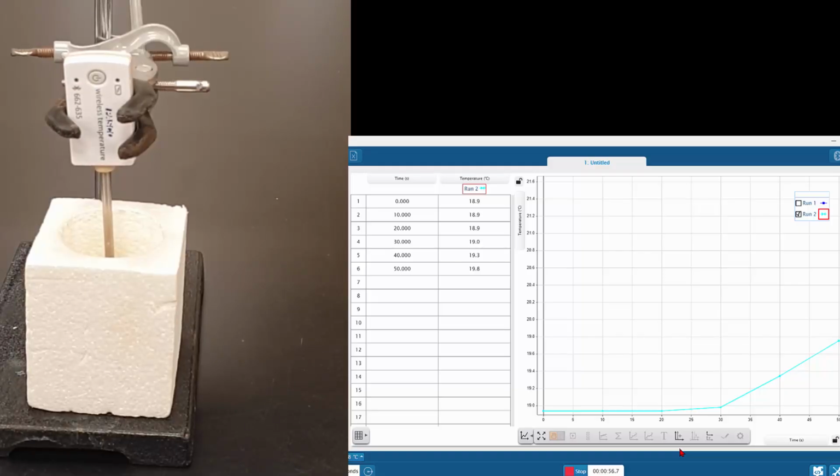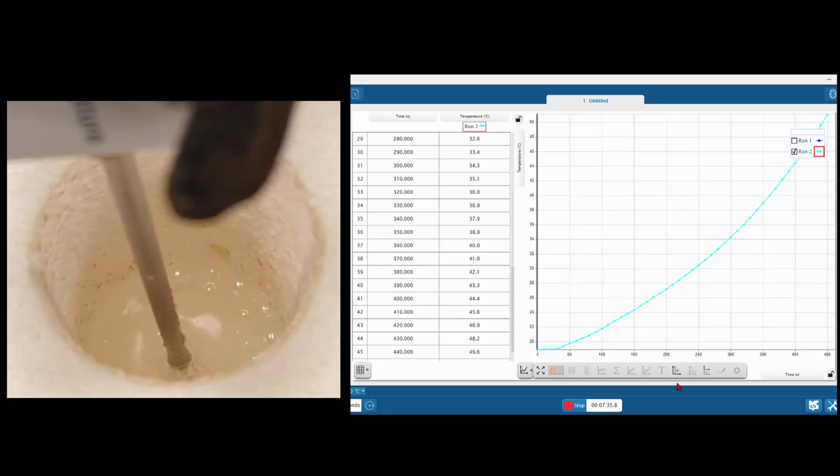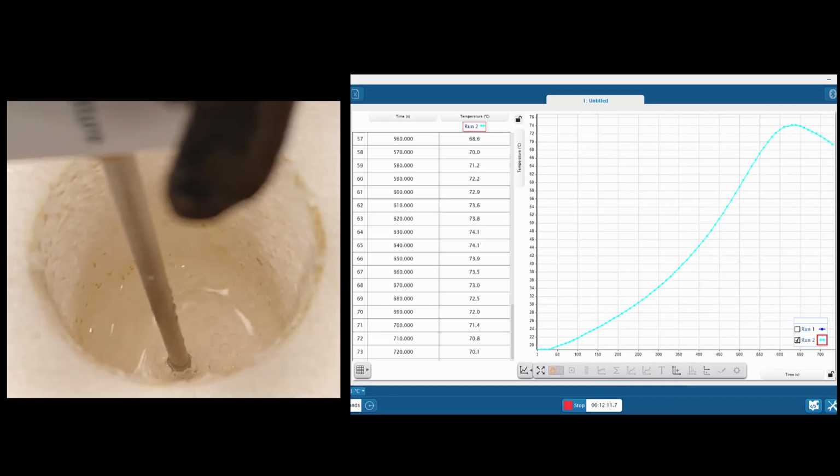But basically you can see, I'll just jump around to various sections. I'll just cut in and out. So you can see in real time how profusely it really bubbles, and it bubbles with even steam coming off. And even when it drops, it's still reacting quite vigorously because the rate of cooling is quite extreme.